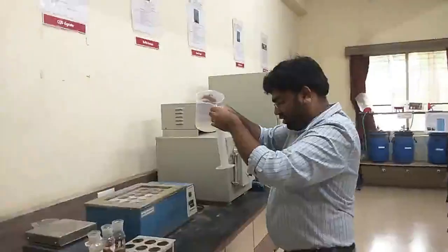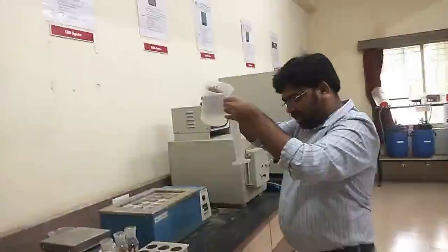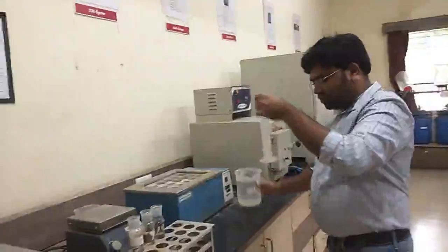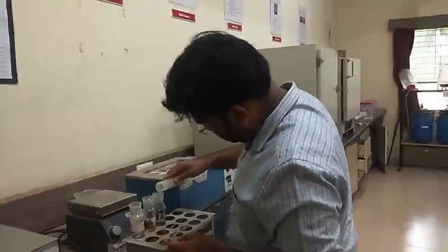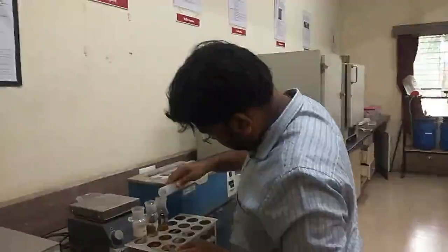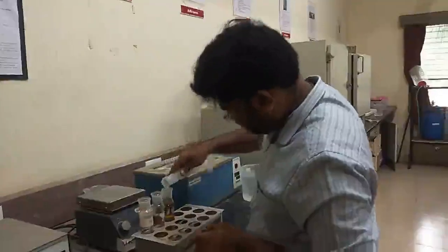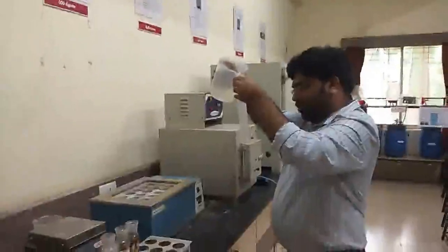Firstly 20 and now 70, so that means a total of 90 ml of distilled water is being added. You will see a completely filled COD digestion flask after the addition of 70 ml of distilled water.